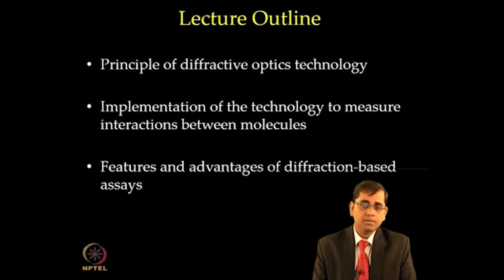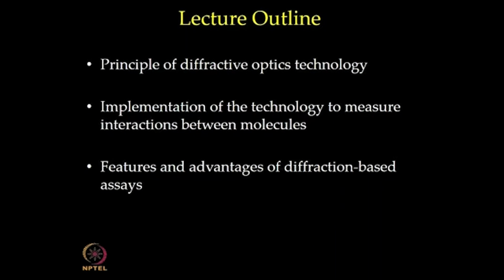During this discussion, she will also demonstrate some examples of how these diffraction-based biosensors can be used for measurement of molecular interactions and their applications in different types of diagnosis and point of care diagnostics.